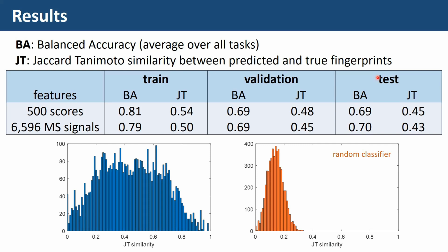Since the result of the processed data is similar to the raw data, the preprocessing might need to improve by using wavelet transform for the time reduction and region of interest for the mass reduction. Yeah, it could be.